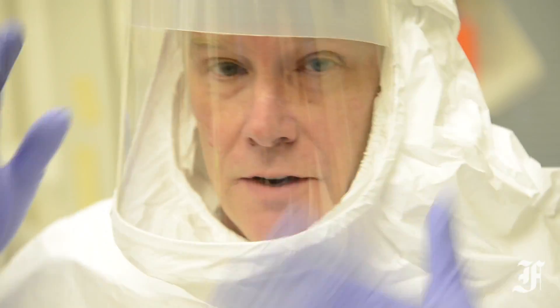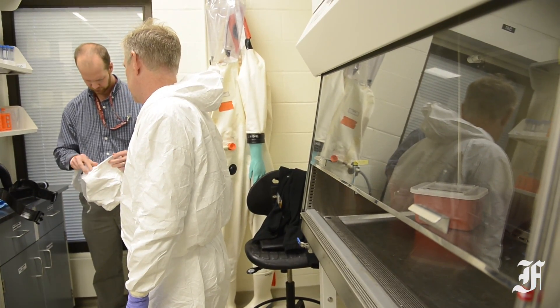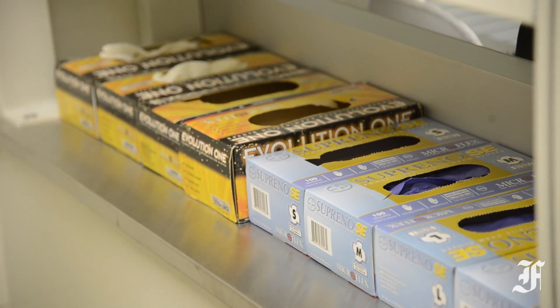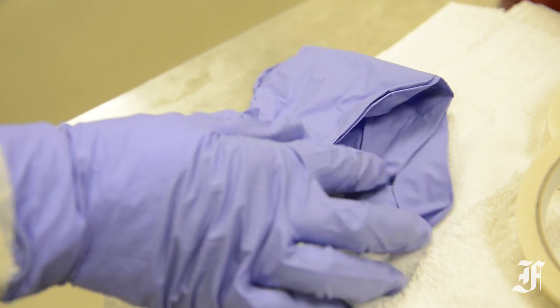Dr. Randall Shope, Chief of the Applied Diagnostics Branch at USAMRID, has spent time in Liberia working in labs testing Ebola patients' blood samples during the current outbreak. As he explains the tedious nature of working in the heat of West Africa, Shope emphasizes the importance placed on gloves.